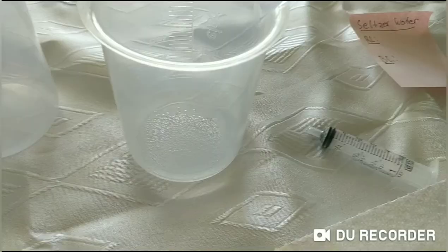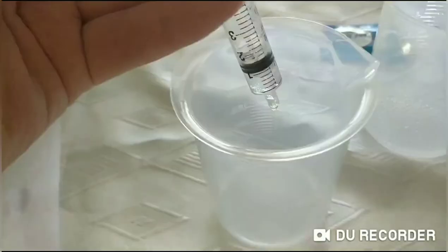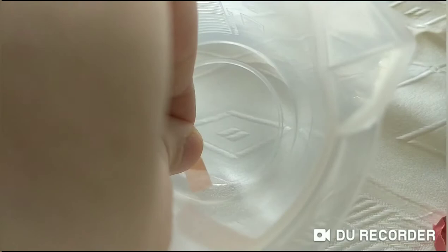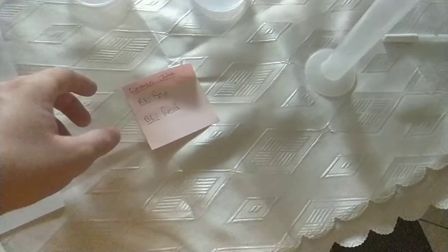Here I have the seltzer water and I'll measure out one milliliter to test it. With the red litmus paper it seems to stay red, and with the blue litmus paper it turns red. Here I have one milliliter of the lemon juice. I wasn't able to record on camera but these are the results I got from the lemon juice. Now we'll go on to the pH paper tests.